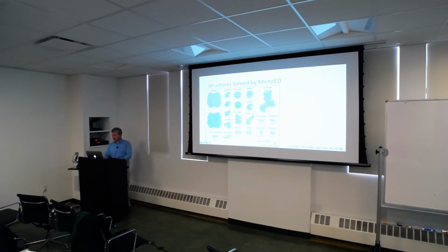Lately, the highest resolution structures have been these tiny little peptides, and those are the ones that have gone to 1 angstrom resolution. Those are I guess the most exciting ones because they're getting to the highest possible resolution.